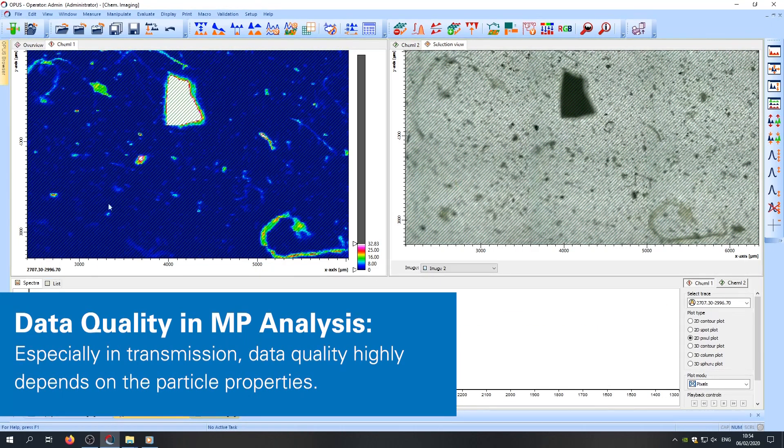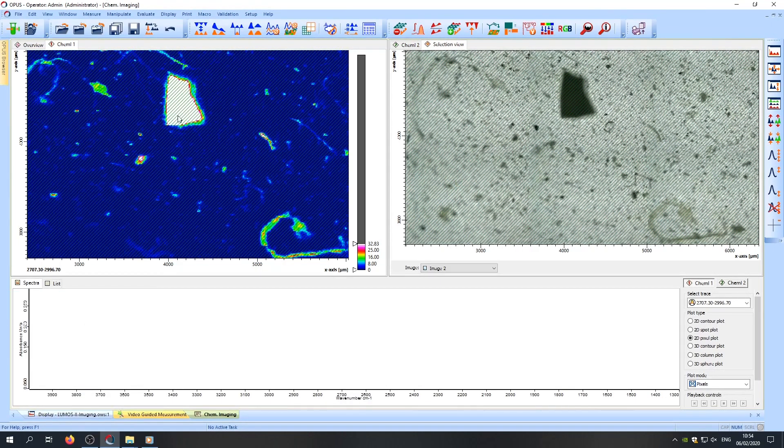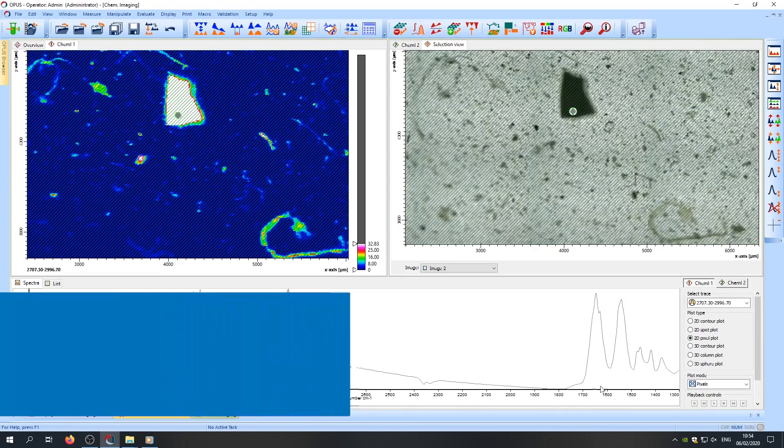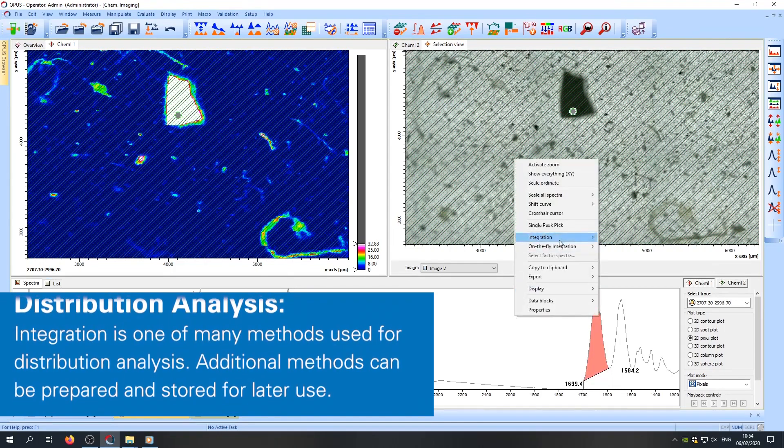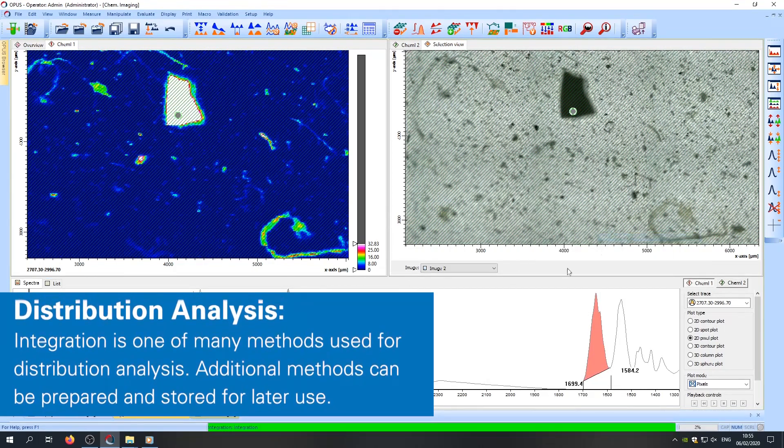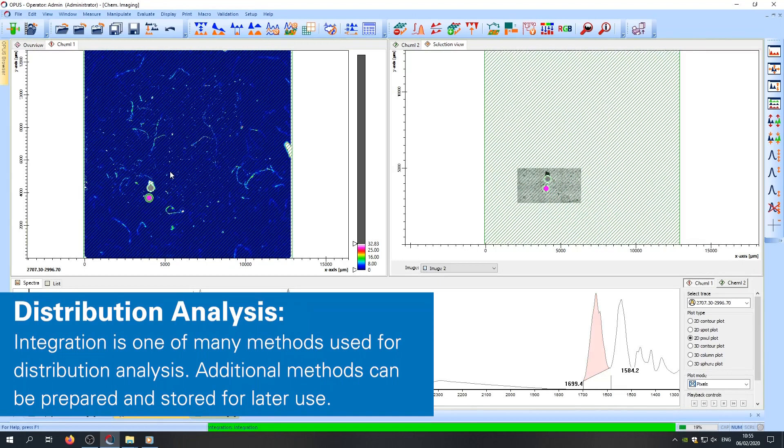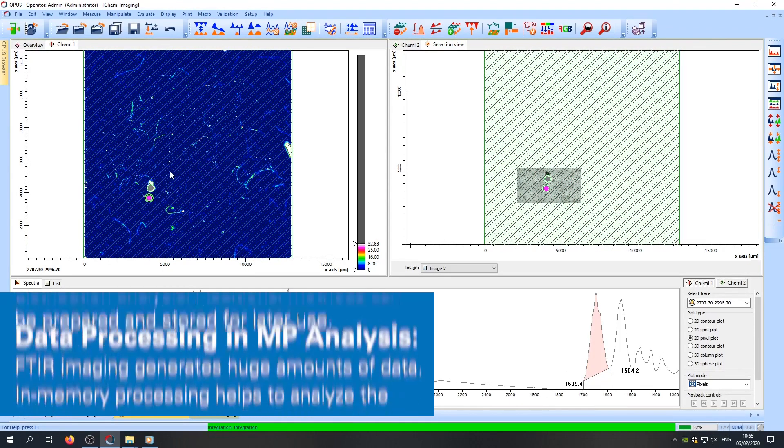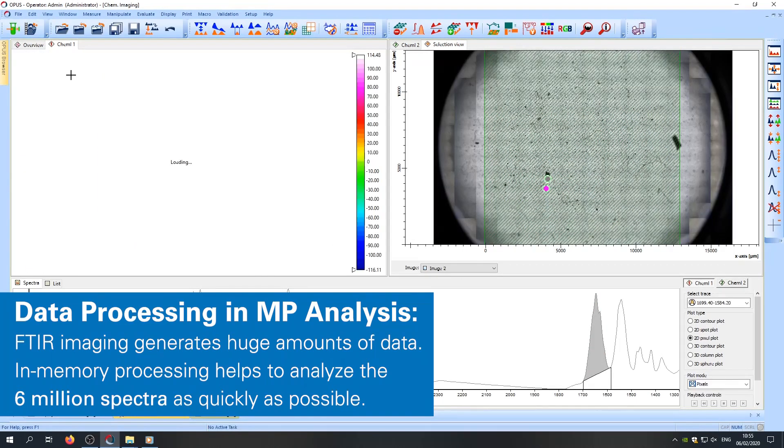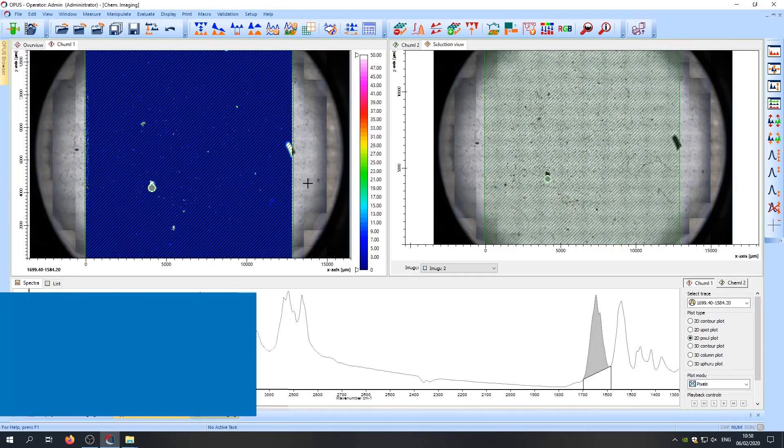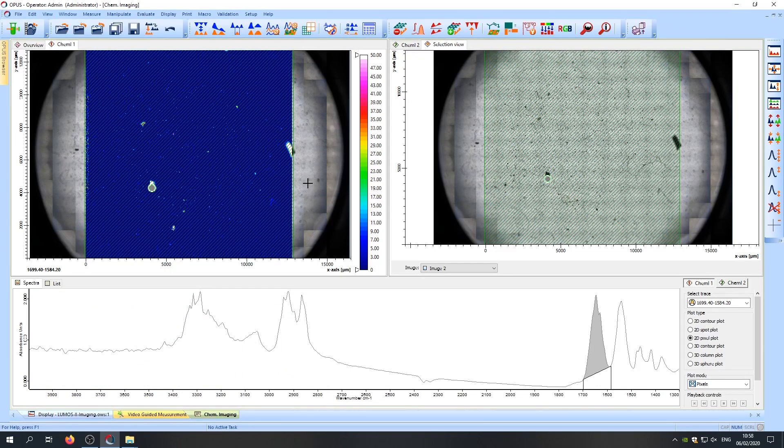If we now want to know the distribution of a certain type of polymer particle, we can just perform an integration by selecting a band that is specific for this polymer and start the integration, which you will see is also working quite fast, giving the number of spectra and the result will be shown in the chemical imaging window. We are now able to see the distribution of polyamide particles on the filter.